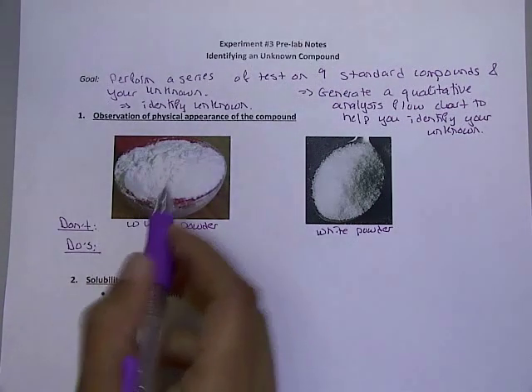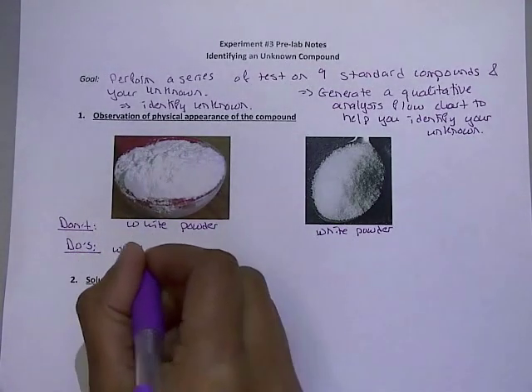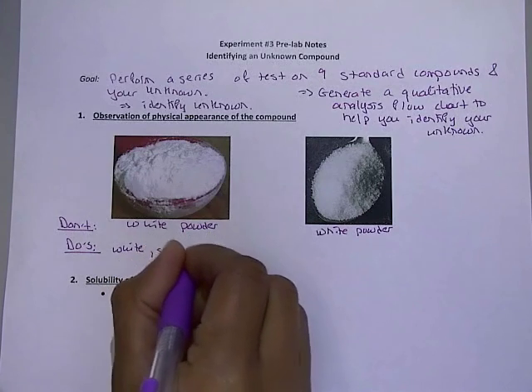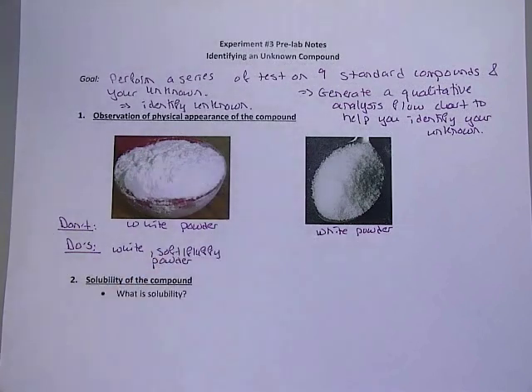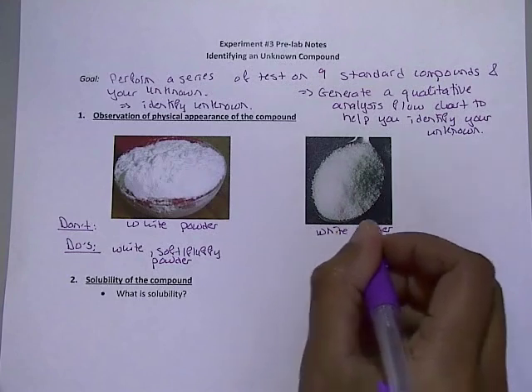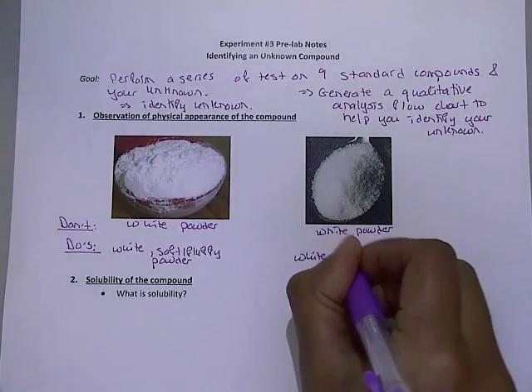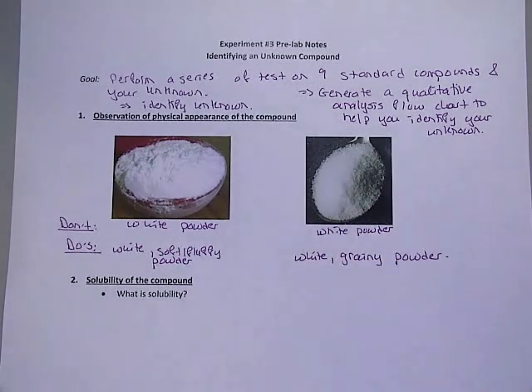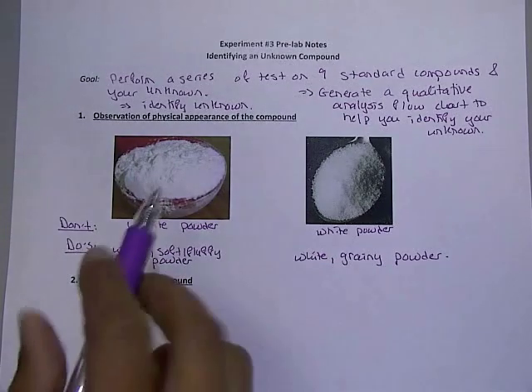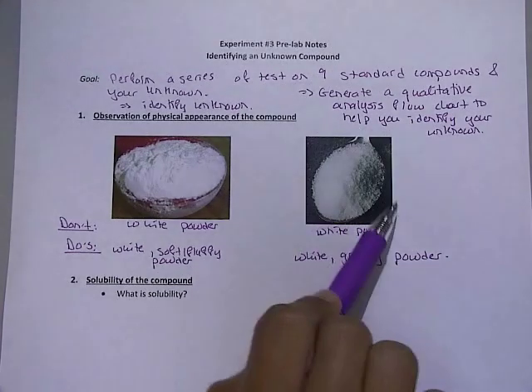material. By doing so, well, this powder is definitely white, so I should write the color. It seems like a soft and fluffy powder. Think of baking powder. Baking powder is very soft and fluffy. Now this powder, on the other hand, is also white, so let's write down the color. But it's not just white, it's actually grainy. So a good observation of the physical appearance of these 2 compounds: this one's a white, soft, fluffy powder. This one's a white, grainy powder.